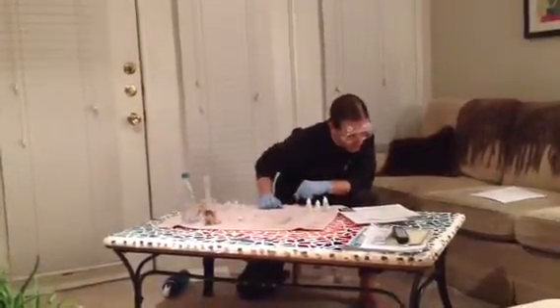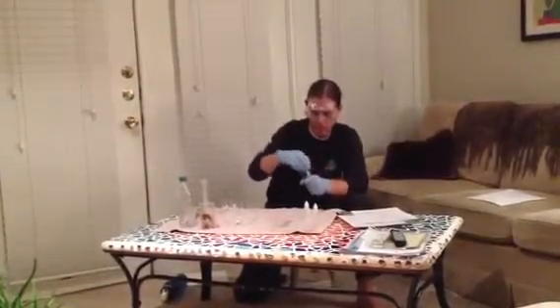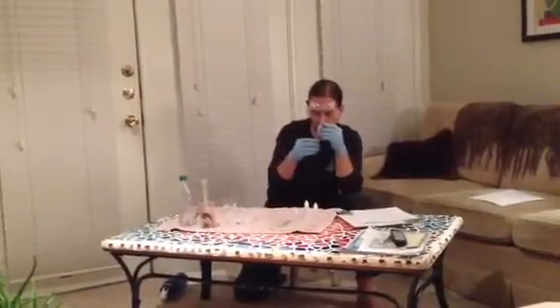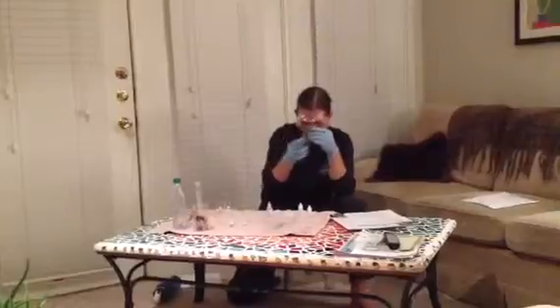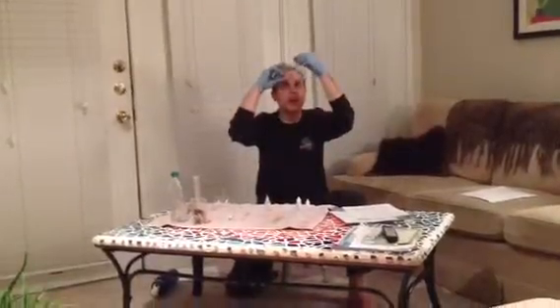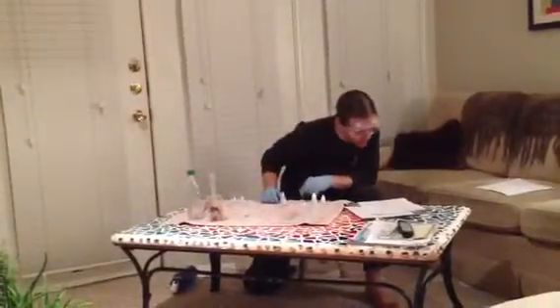Next, I need to put 8 drops of hydrochloric acid here. 1, 2, 3, 4, 5, 6, 7, 8. All right. Looking for a reaction. Doesn't seem to be one.